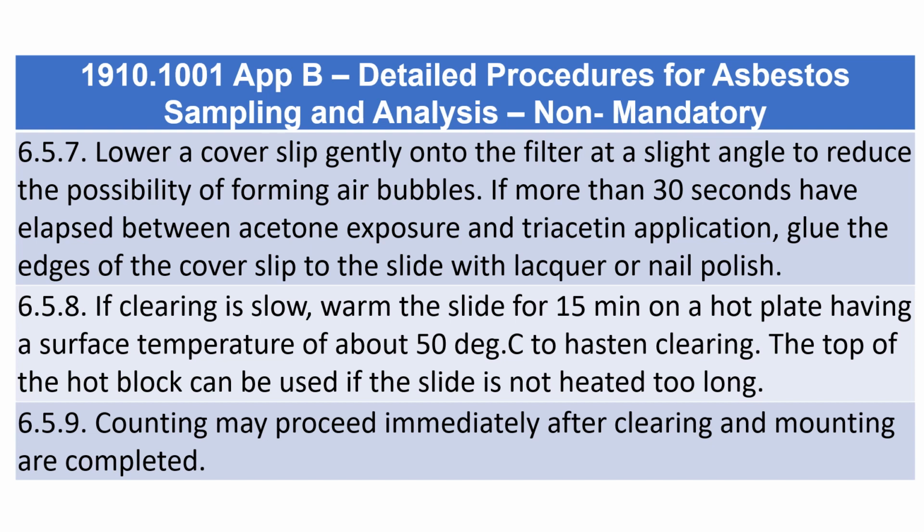6.5.8. If clearing is slow, warm the slide for 15 minutes on a hot plate having a surface temperature of about 50 degrees Celsius to hasten clearing. The top of the hot block can be used if the slide is not heated too long. 6.5.9. Counting may proceed immediately after clearing and mounting are completed.